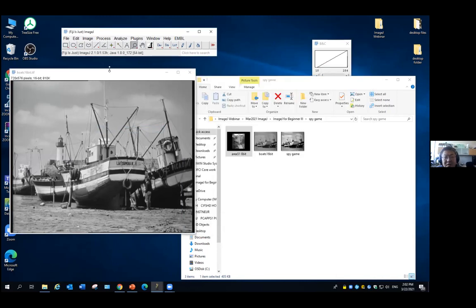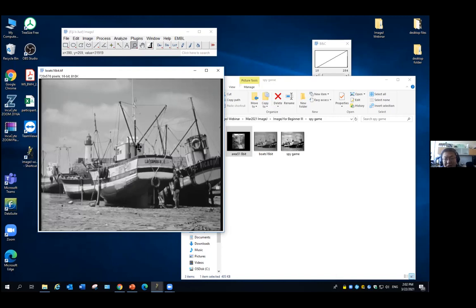Now I close it. So this is my final image. It doesn't look any different, even though we added my secret image into it, because the added image has a very low intensity value compared to those images. But it's hidden in all the lower bit depths in here. So once you have this image, you save it, you send it to your friend, your agent friend.